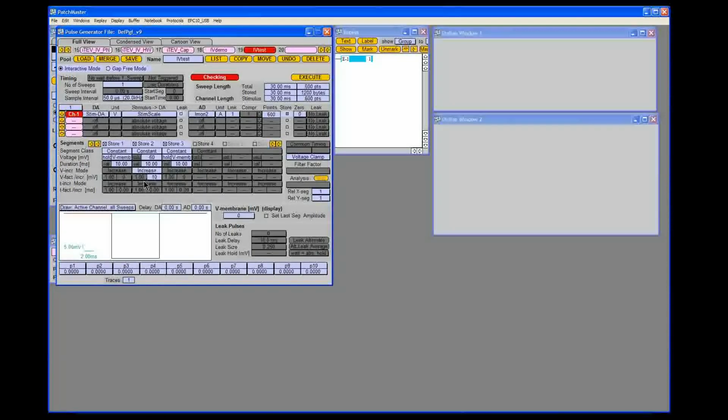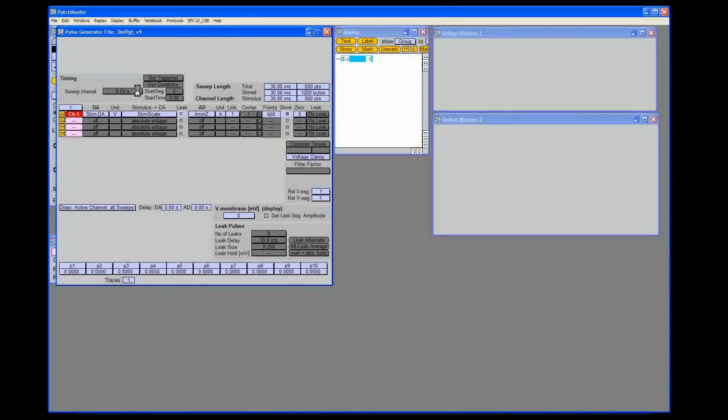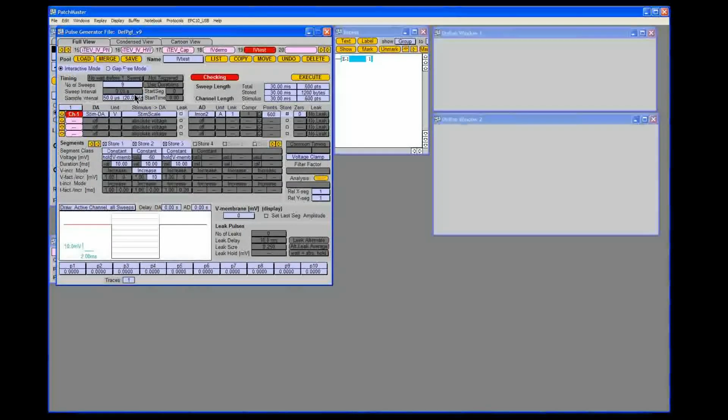As you can see, this had no impact yet because we have to also make a change for the number of sweeps that we actually want to do. So we're going to be doing 9 depolarization steps. We enter 9 here. And here now in the sequence cartoon, you have a good representation of our stimulation pattern. One additional thing to make this accurate is that we need to specify what the holding potential is that we are planning to use. So previously in our amplifier window, we specified -100 millivolts. So we enter that here.